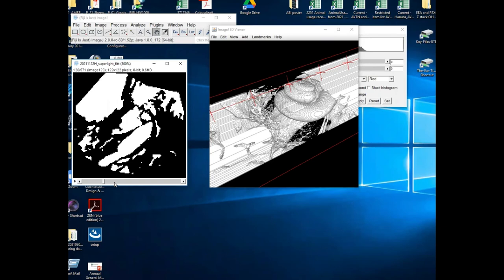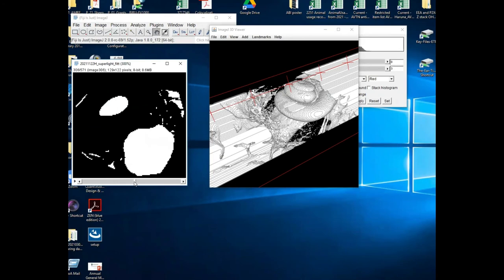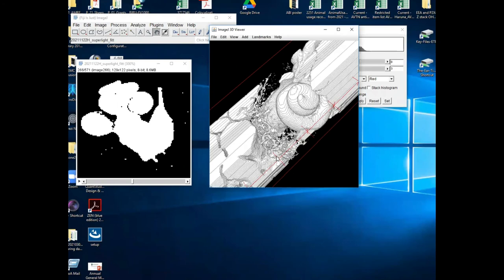We can clean this image. It's looking funny because it's got these extra bits that are white. But we can make this part based on this image, and add a few things in the text if we wanted to. So this image itself can be a starting point in terms of having that shape for the cochlear phantom, which is what I'm hoping to do. That maybe we can do.